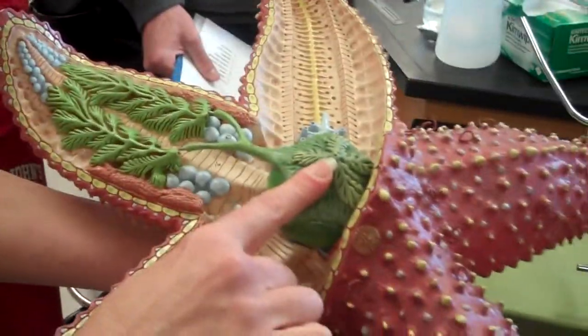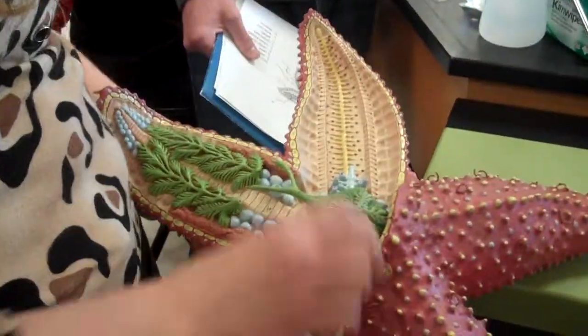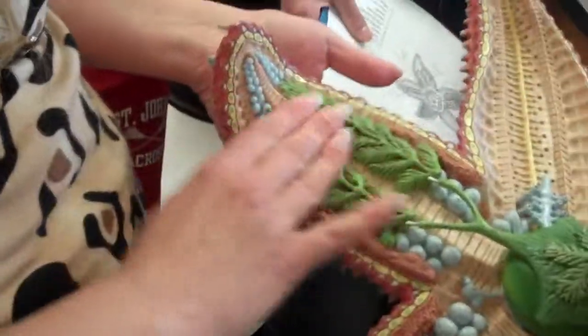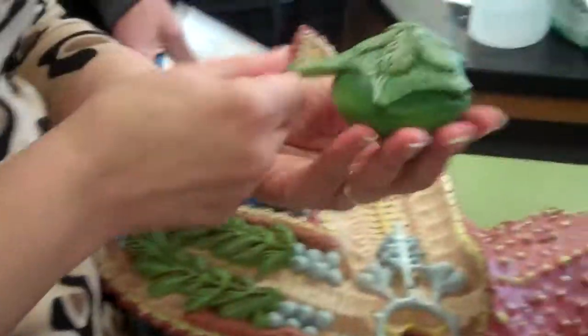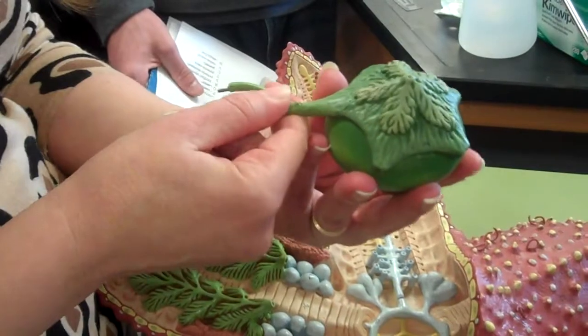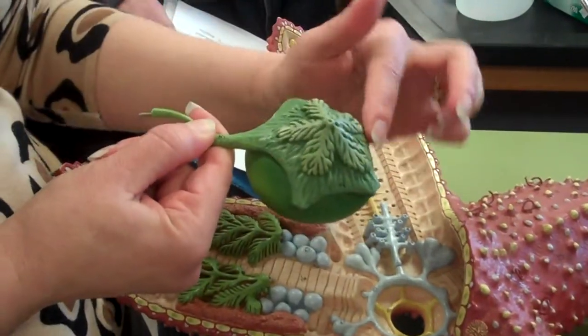The aboral surface has the anus at the top. This is where you find your two stomachs in the central disc. These would be the digestive glands, or pyloric ceca. In the center here, the round stomach closest to the mouth is the cardiac stomach, and the one on top that is pentagonally shaped is the pyloric stomach.